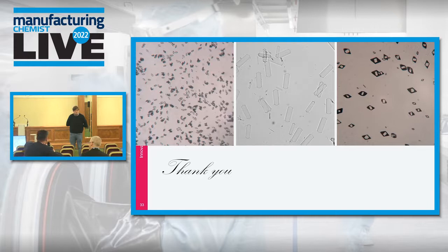What's the smallest amount of material that you can crystallize with? Oh, that is a very, very good question. In terms of the concentration that I've used, the smallest concentration I used was 0.4 milligrams per mil. That's what I've used so far. But again, it all depends on the formulation. As long as your material, when it comes into the anti-solvent, will still be insoluble and you can form a solid that can be viewed and analyzed, it's limitless.